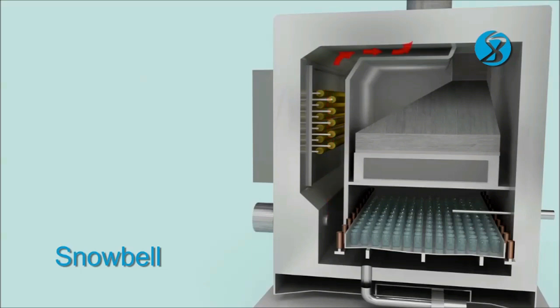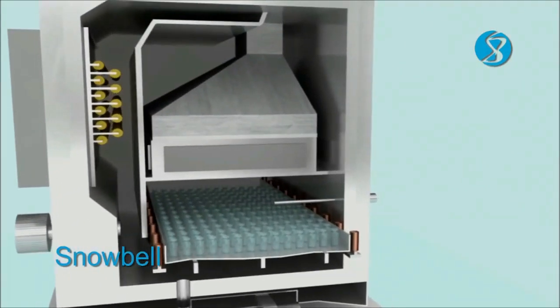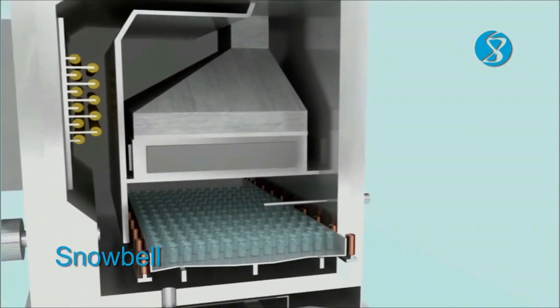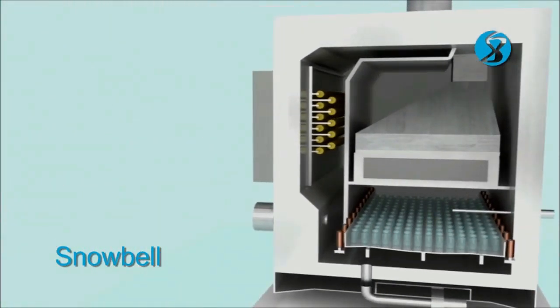Hot air at approximately 330 degrees centigrade is recirculated in this zone. Air heated by temperature-controlled heaters is forced down by a blower through high-efficiency sub-micron filters. An equal pressure drop across the length and breadth of filters enables creating an extremely even distribution of air. This uniformity enables each and every vial to be treated with hot air at the required velocity, temperature and duration.